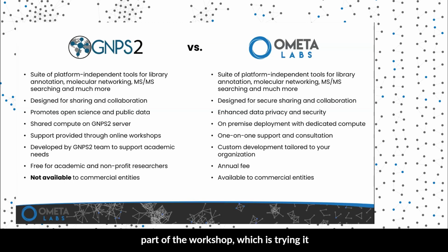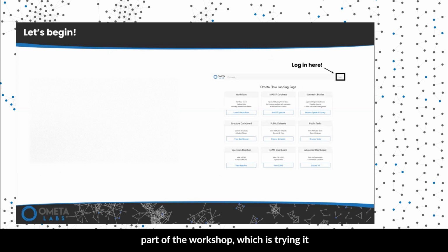Let's get to the fun part of the workshop, which is trying it ourselves. So I'm going to have you navigate to our demo server. I'm going to paste this information in the chat so it's a little bit easier to just copy paste. You should see that link in the chat. That will get you to our demo server. Once you're on our demo server, if you look in the top right-hand corner, you can use this username and password to log in.